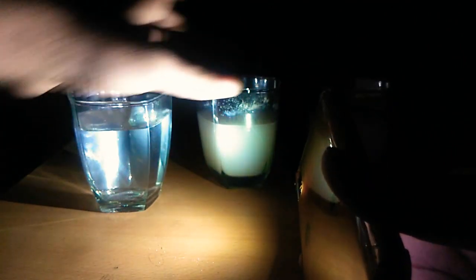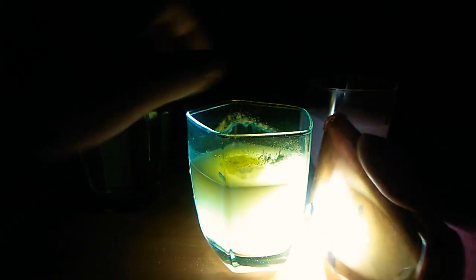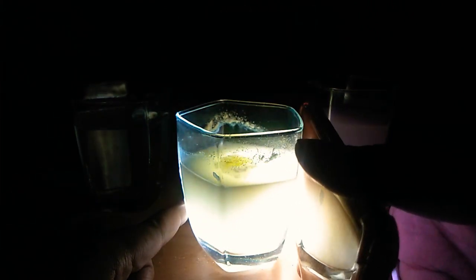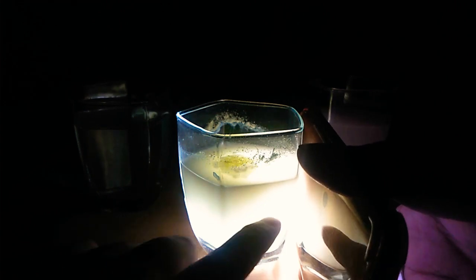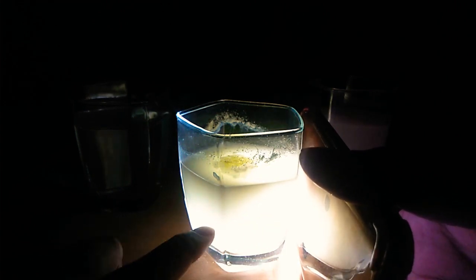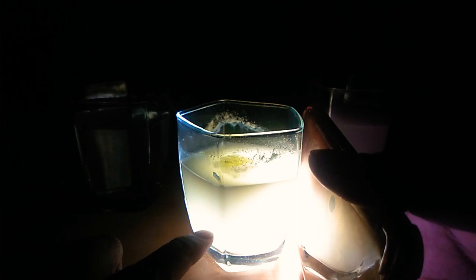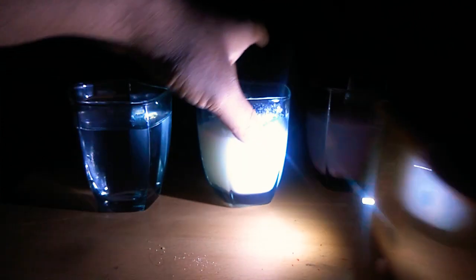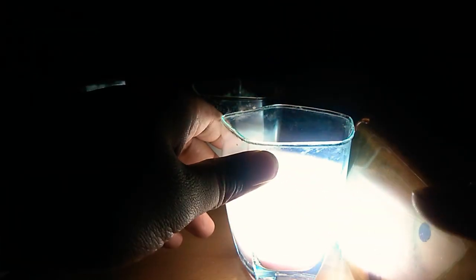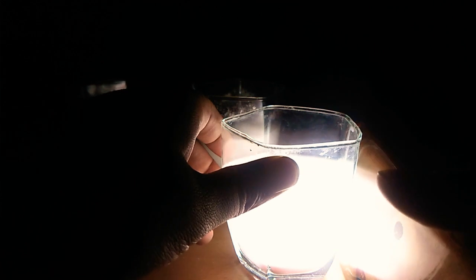But if you look at milk, this was the colloid. If I put this light against the milk, inside the milk you can see the beam of light passing through the colloid. That is an example of scattering of light. And in case of suspension also, if we place the light against the suspension, you see that the entire suspension has got lighted up. That means it is causing scattering of light.